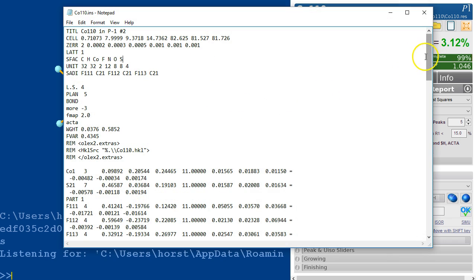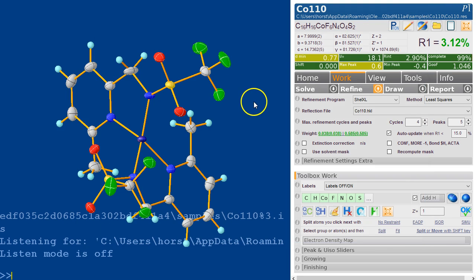you sort of have a live interface. Any changes you make here, once you save it will be reflected in Olex 2. But really, you shouldn't need to do that at all.